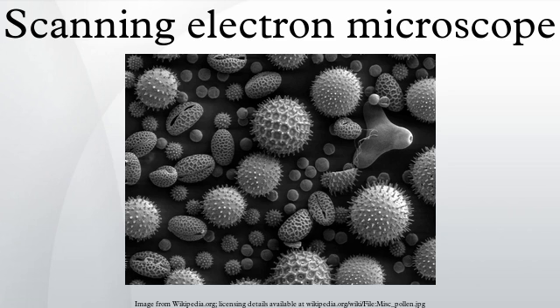Scanning process and image formation. In a typical SEM, an electron beam is thermionically emitted from an electron gun fitted with a tungsten filament cathode. Tungsten is normally used in thermionic electron guns because it has the highest melting point and lowest vapor pressure of all metals, thereby allowing it to be heated for electron emission, and because of its low cost.